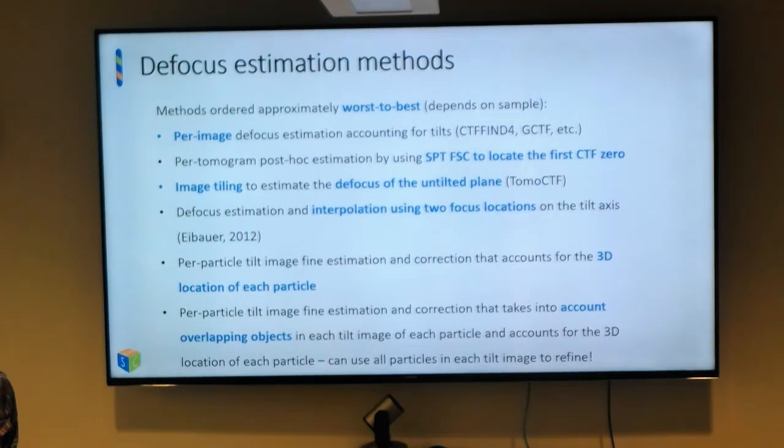No. Well, it's a way to effectively figure out, in this scenario, the frequencies in common with all of your objects that you're averaging together. What effectively happens is you get a dip at the first zero because it says this frequency is anti-in-common. And then from there, you can say, okay, I know where my first zero is, and correct it. So it's actually a decent way that can get you sub-nanometer resolution.